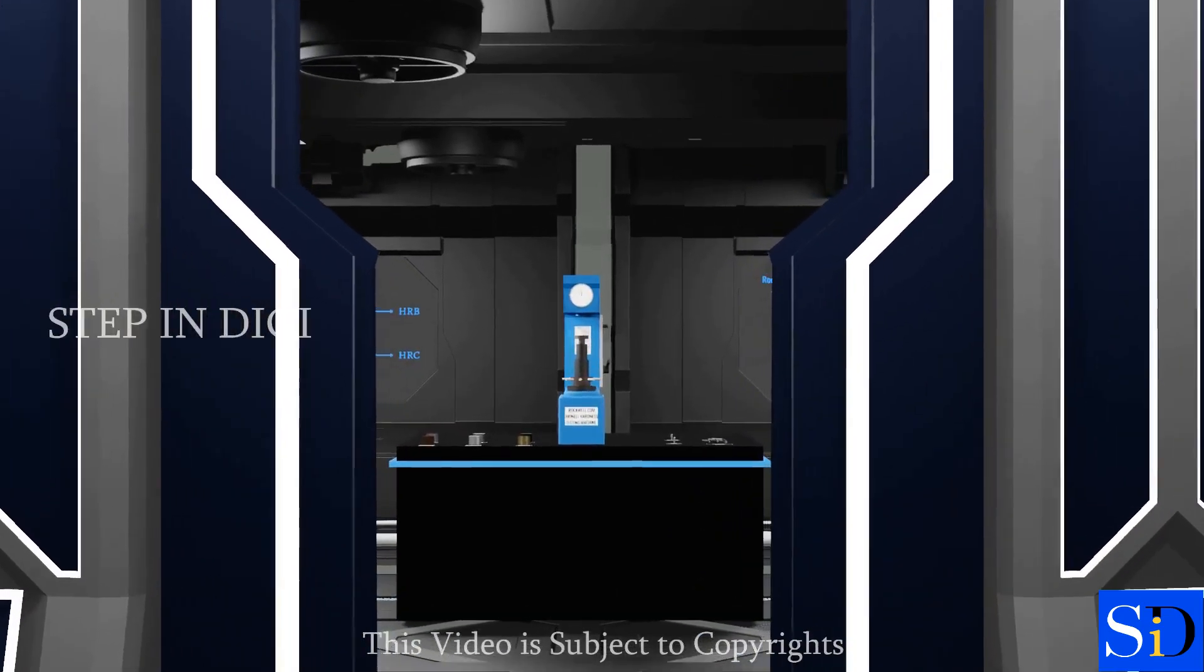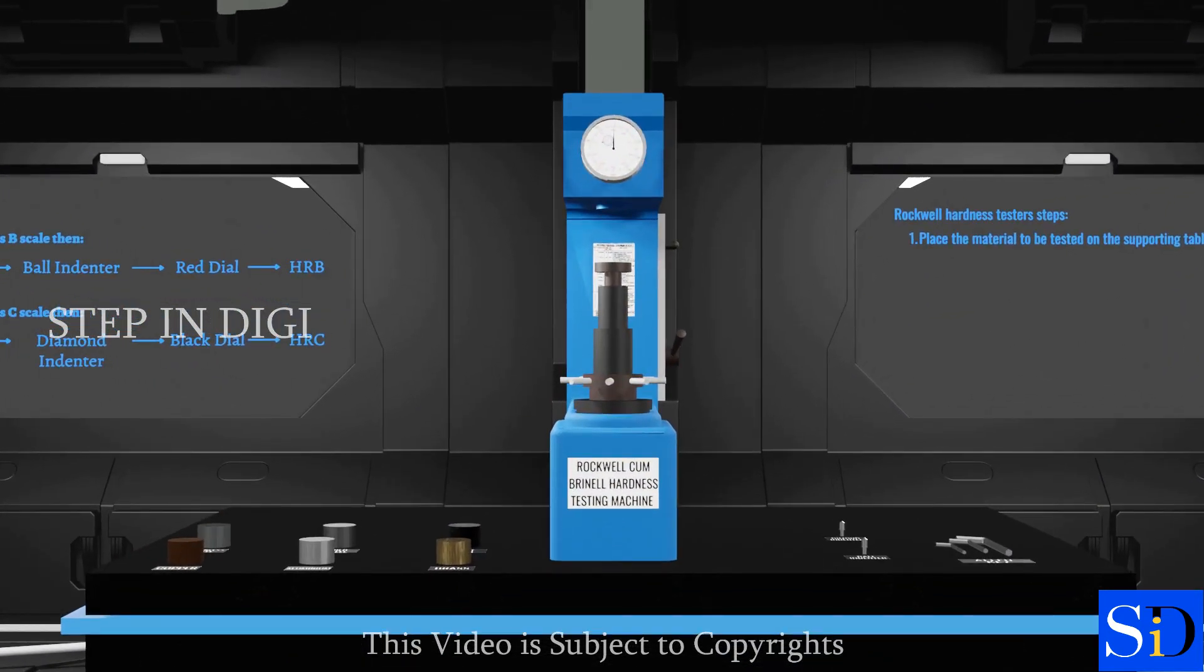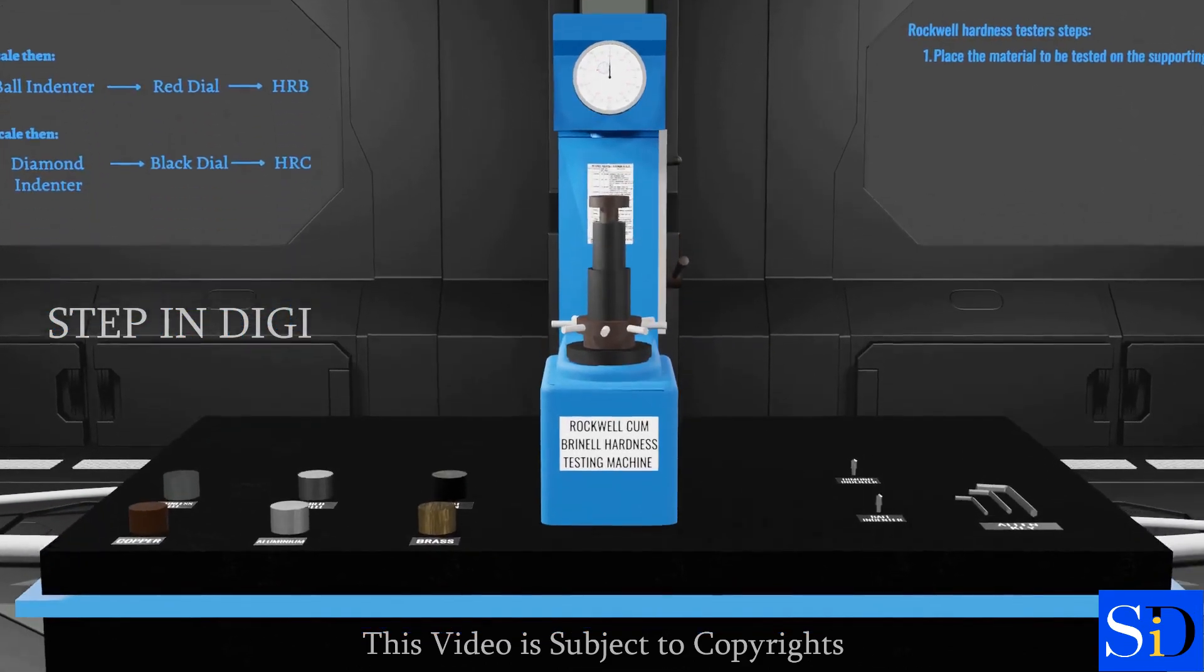The Rockwell Hardness Test is generally a non-destructive test performed on samples when it is necessary to determine how hard a material is.